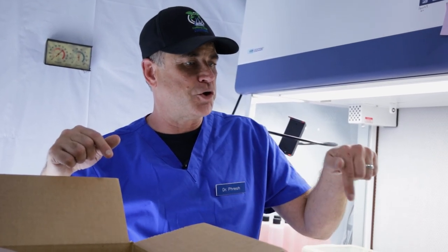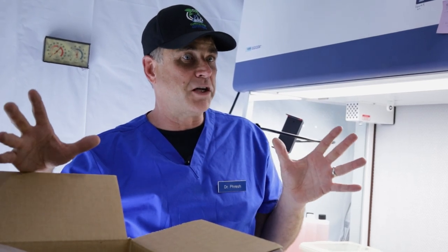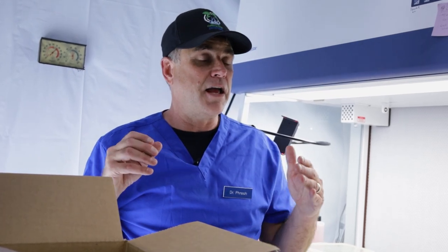Everybody chose a great plant to be their mother, but that was back in July or August — six, eight, ten months ago. Mother plants can't be over-cloned. So we wanted to make this a frequent turnover system: put veg plants, tissue culture, and the incidental clones from them all together in one clean area that we treat just like this clean lab space, and not bring any more diseases into that space. The space is going to flush itself clear, just like your skin.